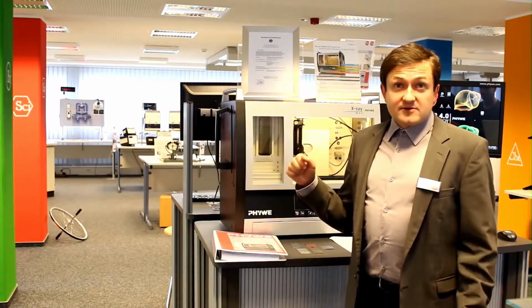Hello everybody, welcome to this video lesson. Today I'm going to present some special experiment using X-rays, which is the quantitative fluorescence of alloyed materials. Okay, let's start.